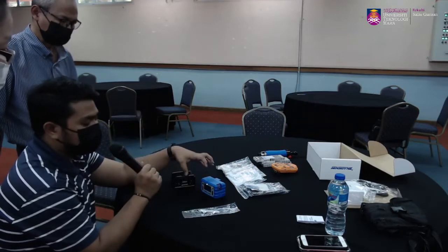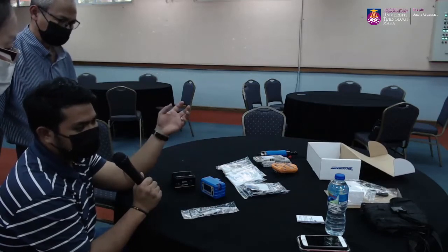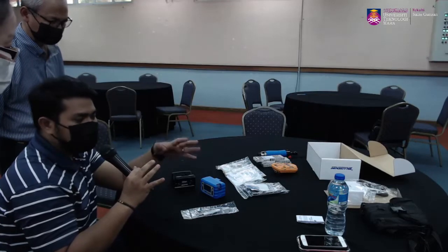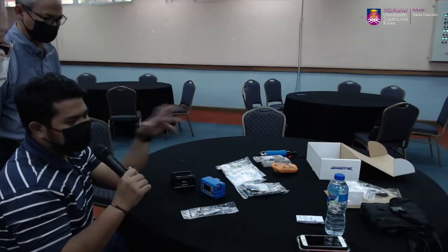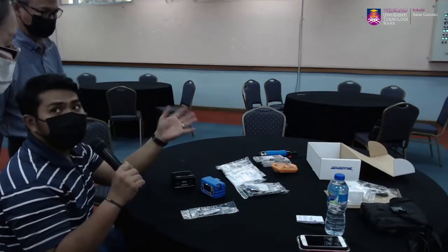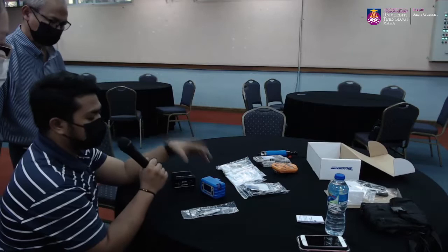So the advanced unit has extra features in terms of the software, which can give us our flow rate. In terms of the total 8 hours, we can analyse from the start until the end how much fluctuation there is. Usually when we sample at site, we just leave it for 8 hours or however many hours we need to collect the sample, and we just pick it up. We don't know whether there was fluctuation or whether the Tygon tubing got blocked or something. So from there we can do further analysis of our sampling.